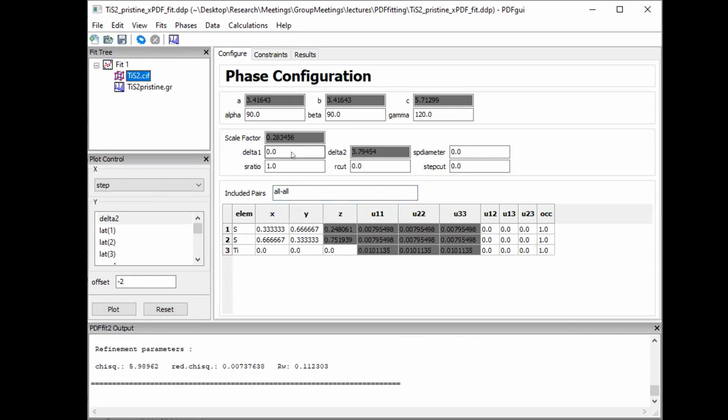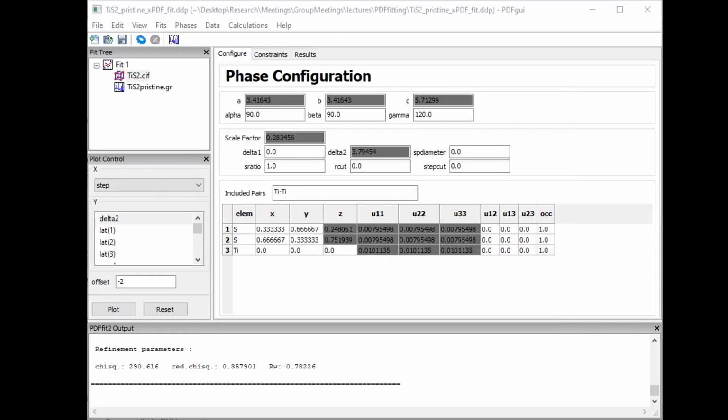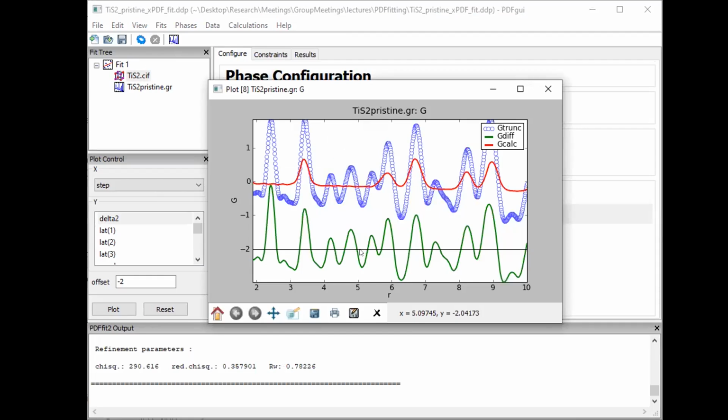Okay, and then we check the titanium. So this is what I want to show you. You see, it's telling us titanium is only contributing a fraction of this peak. This is against what I thought in the beginning. So you see this peak actually has maybe only a quarter of the intensity contributed by titanium. And you can also see the contribution of titanium to other peaks.